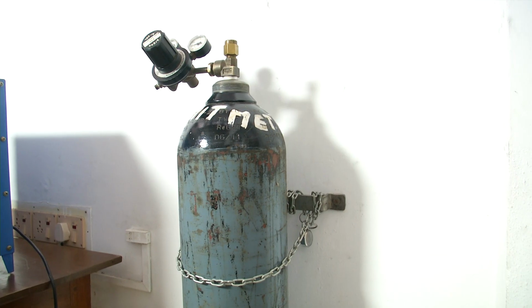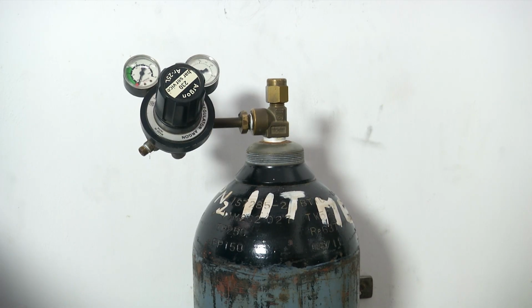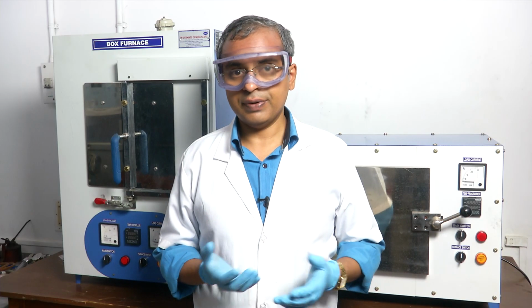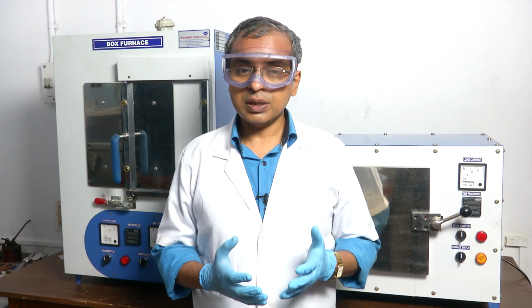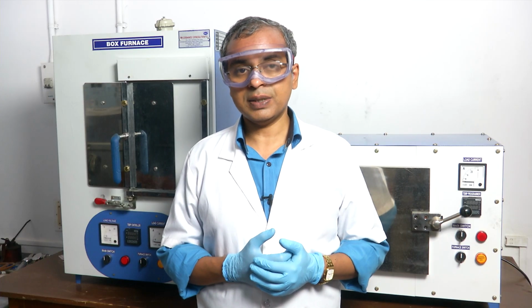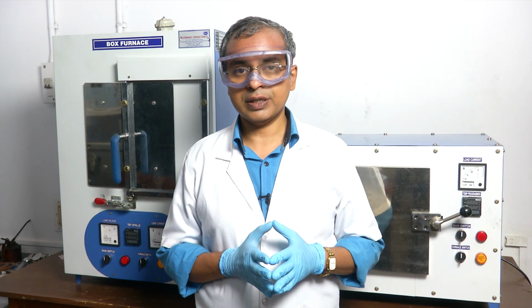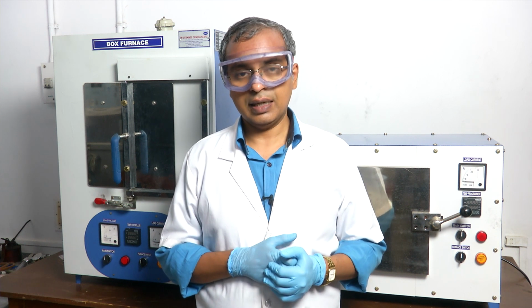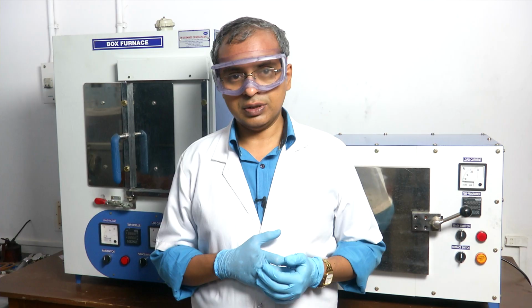Of course, it depends on what experiment you are running, but many experiments will often require some kind of a controlled atmosphere. So, maybe you have a nitrogen bottle, maybe you have an argon bottle, or maybe even an air bottle, but the most important thing is the bottle is a pressurized unit. There is gas present inside it under high pressure. So, there is a certain way in which it has to be handled, so it has to be handled safely. So, that is the other common thing that you see in labs.